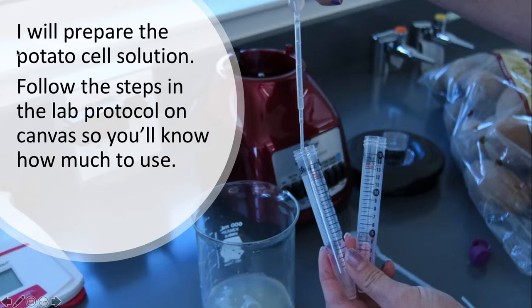We'll talk about why some of these tactics can help with preventing browning in different fruits and vegetables. Our vegetable of choice is a potato here. This browning is caused by a specific protein, an enzyme specifically. What should be jogging your memory from lecture is: what are you thinking about proteins? What determines their function? What can prevent them from doing their function? And what may speed up the function?